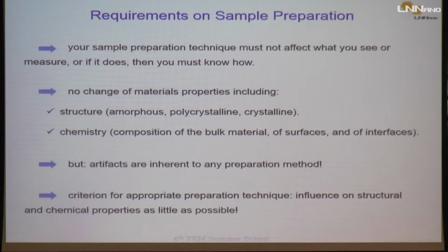I saw that I had a different kind of metal oxide distribution in one sample, not any in the other. And I did some XPS surface analysis, and I learned that my sample has a specific distribution of elements on its surface.